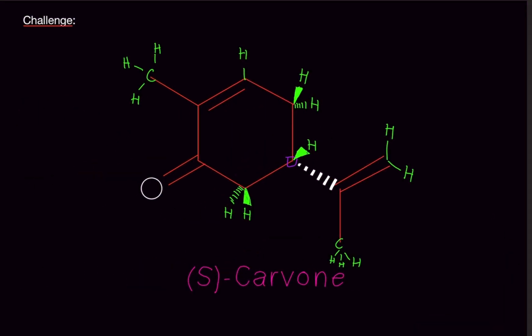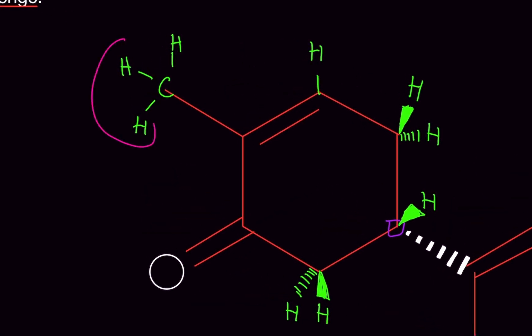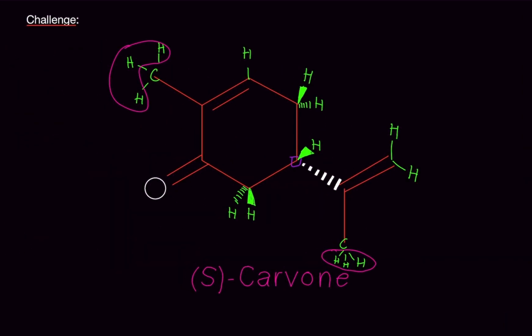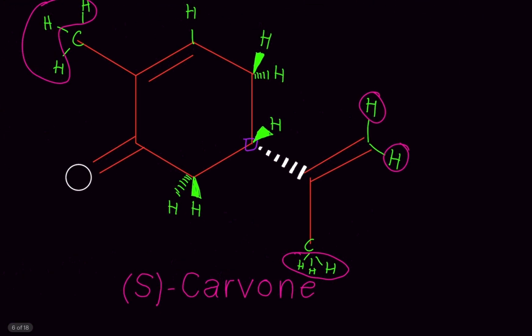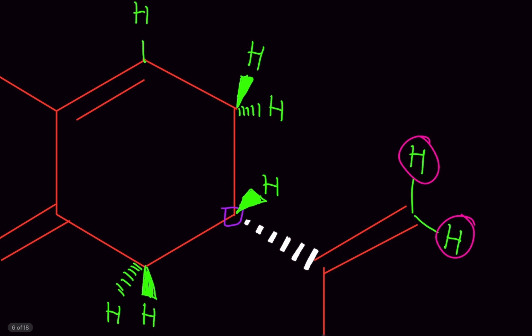Okay, first thing as always, circle all the hydrogens within a methyl group. This. Okay, now, this is where, actually, let's do this part here. These are going to be individual because we have a double bond. That's the trick, okay? That's the best way to tell you, okay? Now, this is going to be alone because it's part of a chiral carbon.